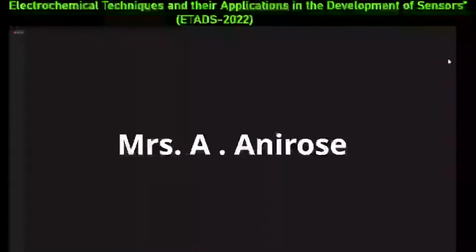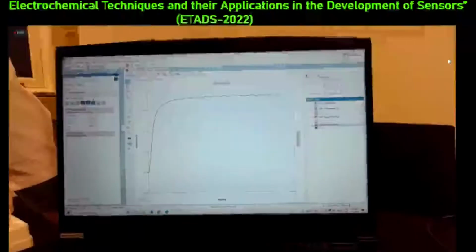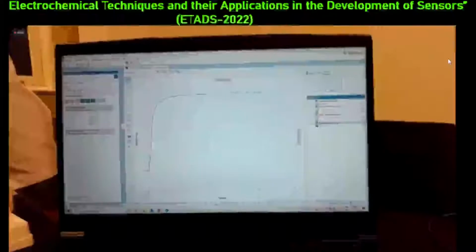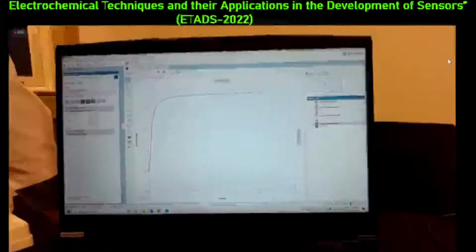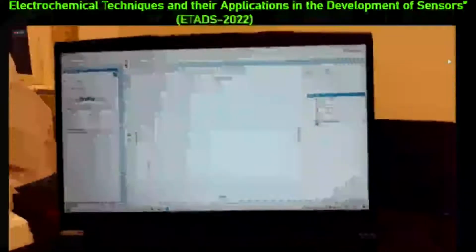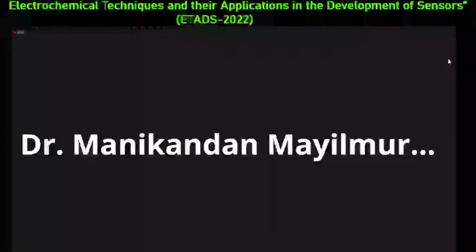This is a typical amperometric curve. You see first there is an increase. It starts at a higher current, then it gradually goes towards a baseline. This is like a charge effect at the interface between the electrodes and the solution. I presume, since this has been pre-wetted, we have quite a good stable line.